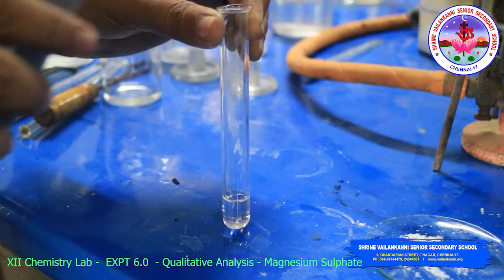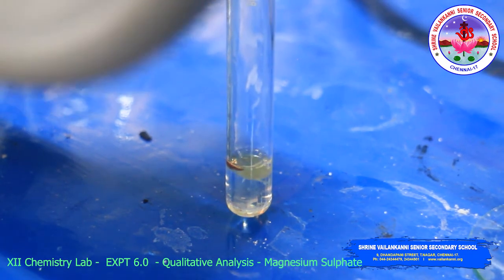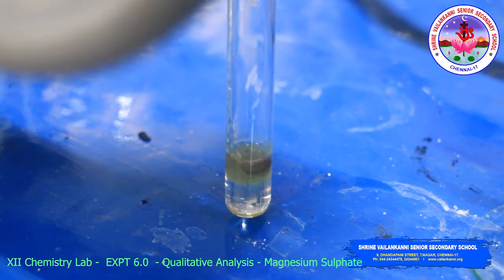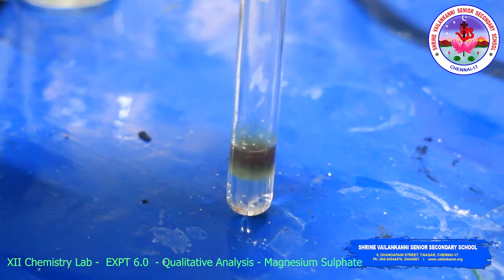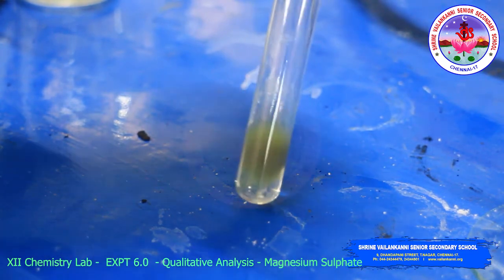Now add Magneson reagent to the original solution. A blue color precipitate is obtained, the light blue is showing.